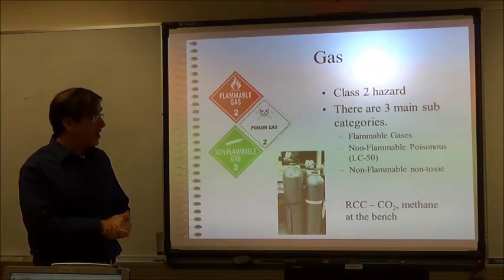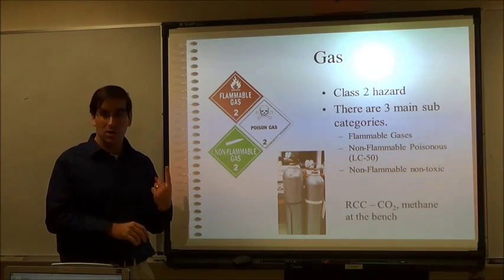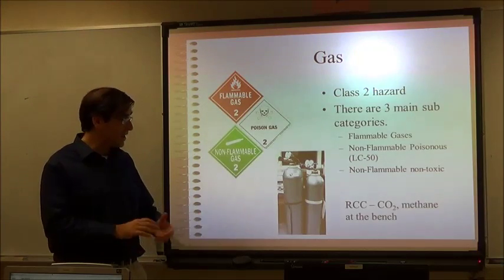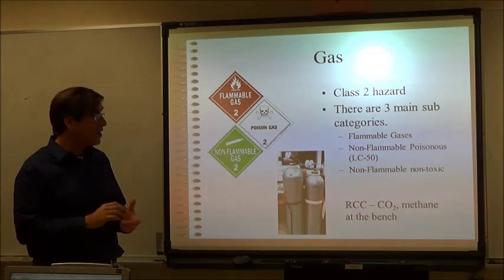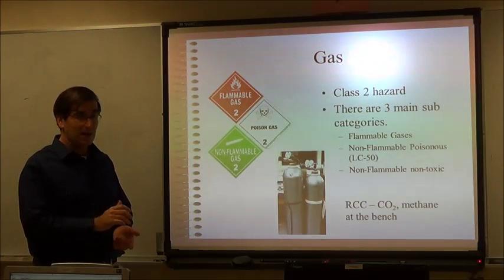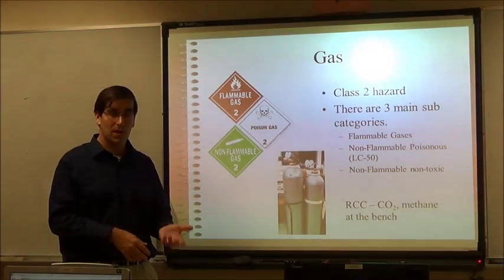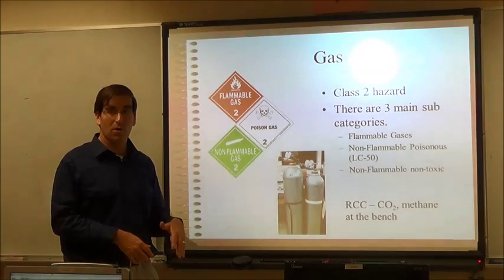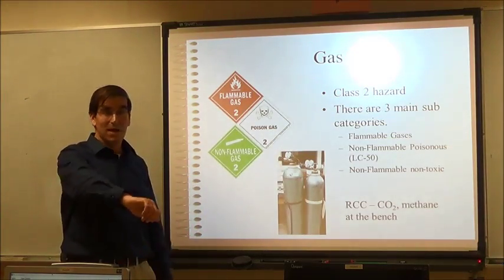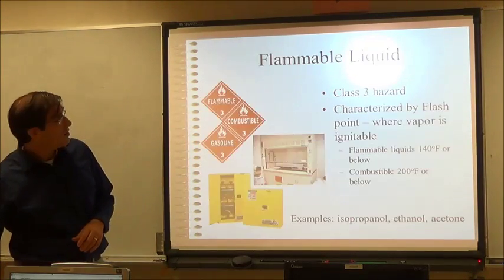But this is also one that I need the faculty to pay close attention to, because there's not only the student shut-off valves that we need to make sure that the students close after every class that they use it, or after every time they use it, but there's also the main shut-off valve in the hallway, typically outside the classroom. And it's the responsibility of the faculty not only to call, say, the security or a technician to turn that on for them, but to make sure that that's turned off after the class. We want to make sure that nobody can just come in randomly to the lab space and, say, play with one of the gas valves on the desk and have gas coming in.